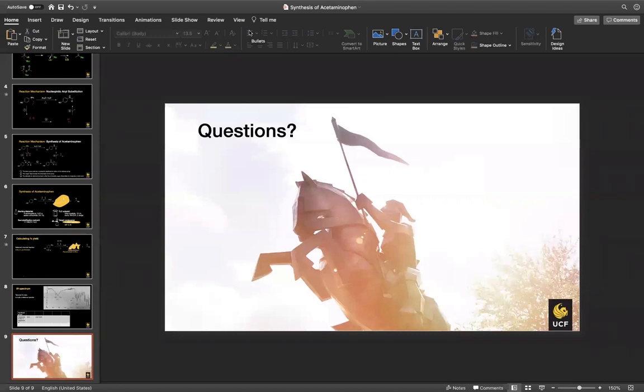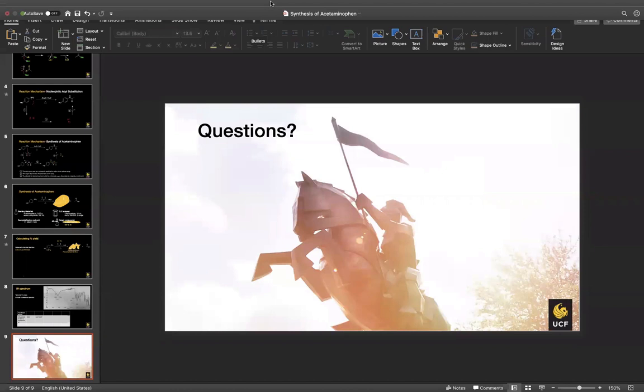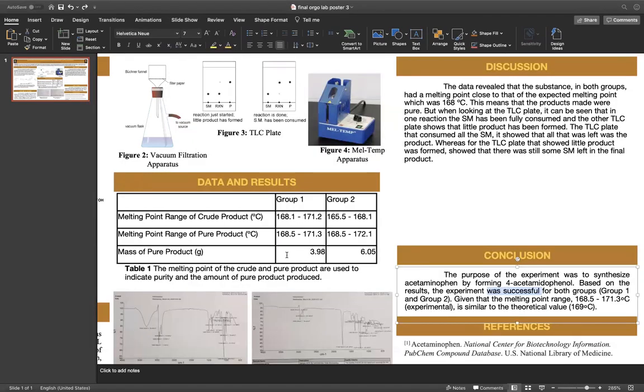I have a question about the IR. Yes. So do we need two IR spectrums, but only one table, right? Right, yeah. And the first IR spectrum is of our reactants, so we're seeing what functional groups were lost. So we actually don't have the IR of the starting material. It would be a reference spectra, how the spectrum would have actually looked like.